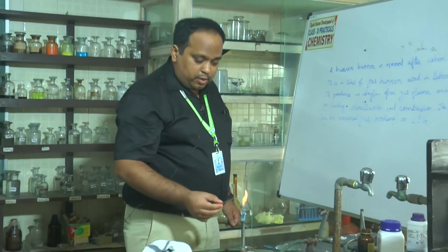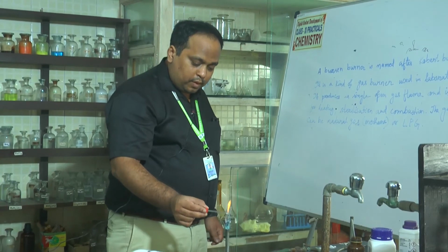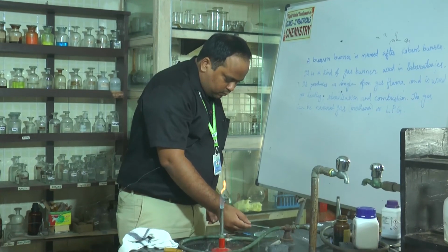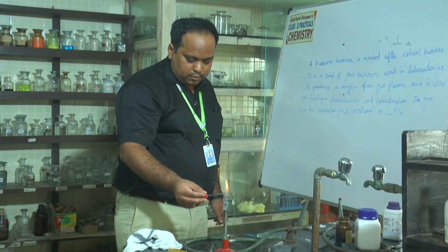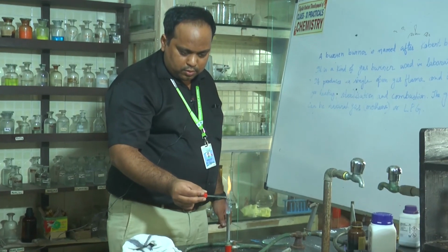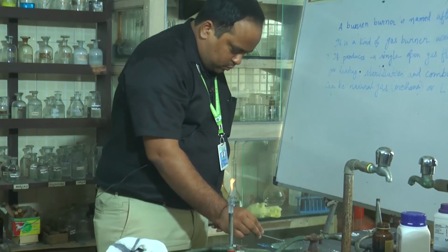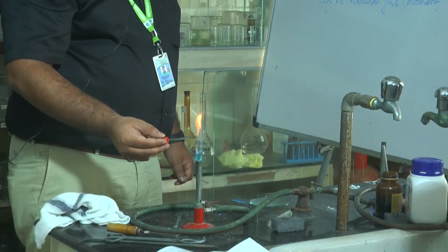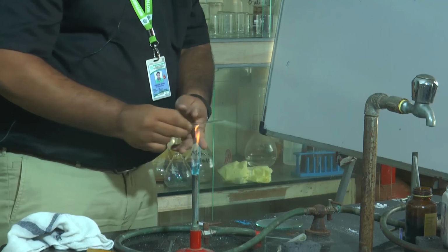Okay, next. I am taking another one and showing it to the flame. See, some color is visible here. Yes, light pink is coming. One minute, another one I am doing.